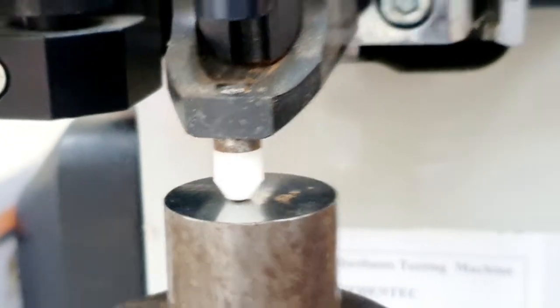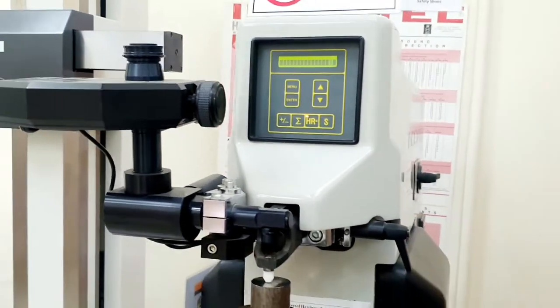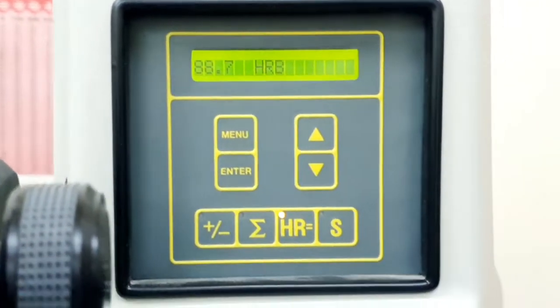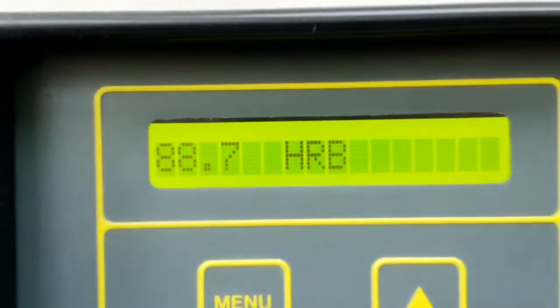Now we are ready for testing and we can proceed. This machine has an automatic starting system and will put the load for 15 seconds, then give you the value of hardness — which is 88.7 HRB in this case.